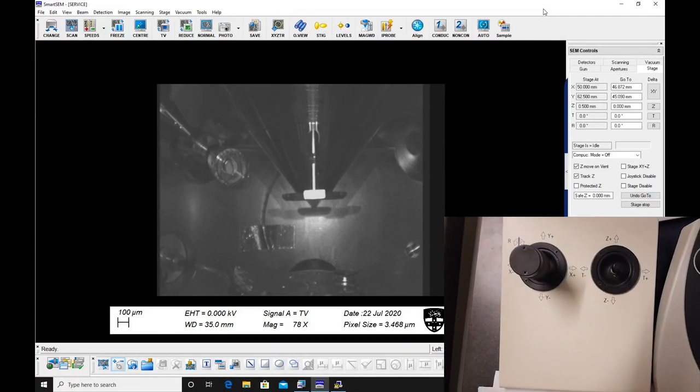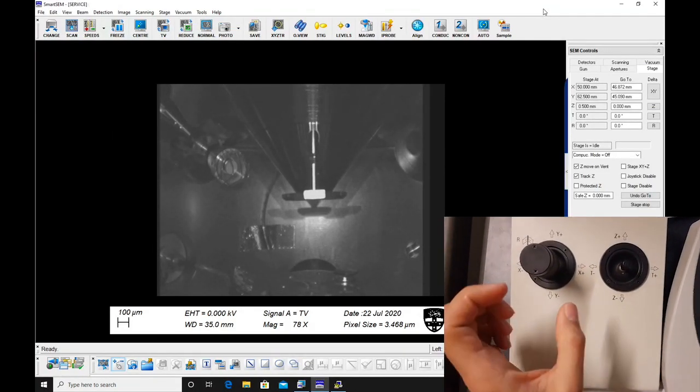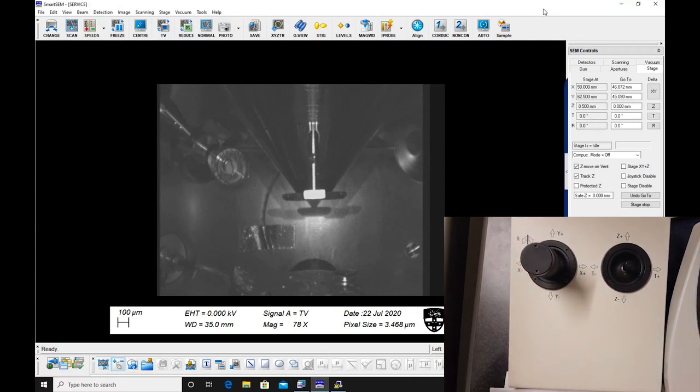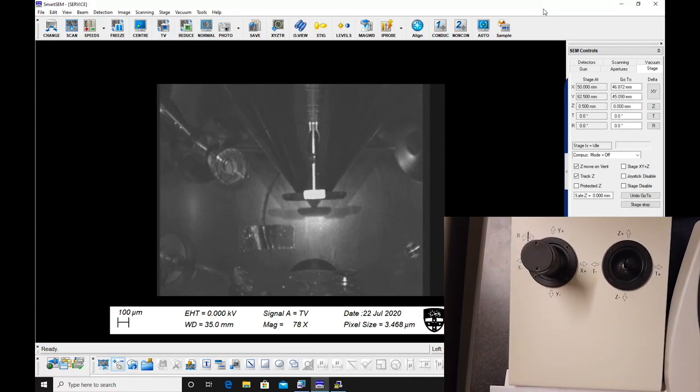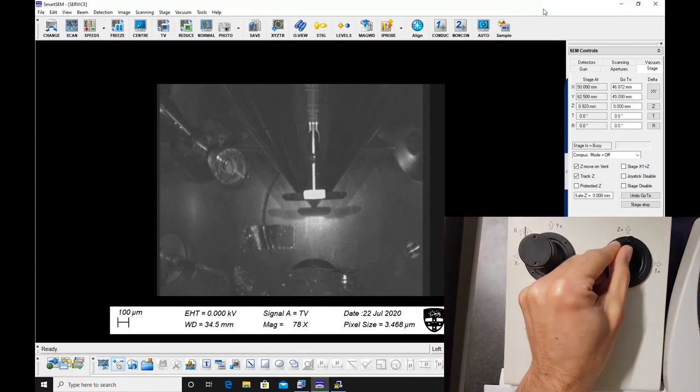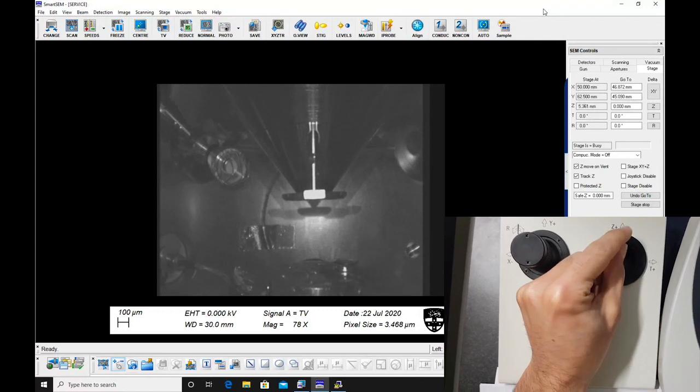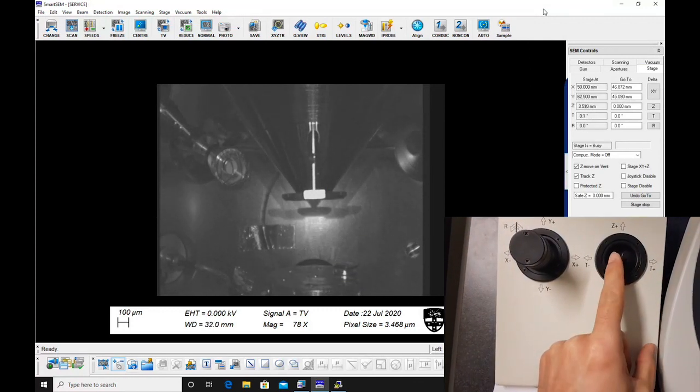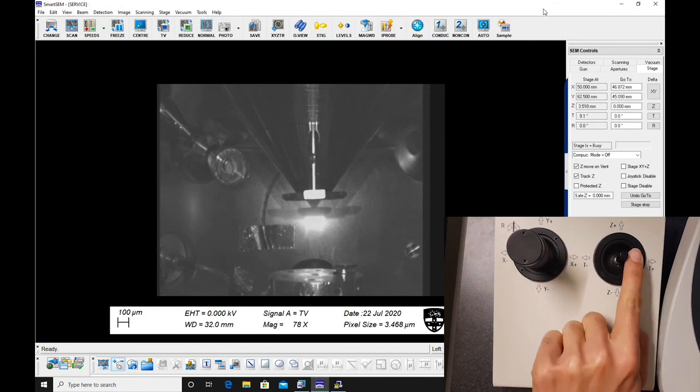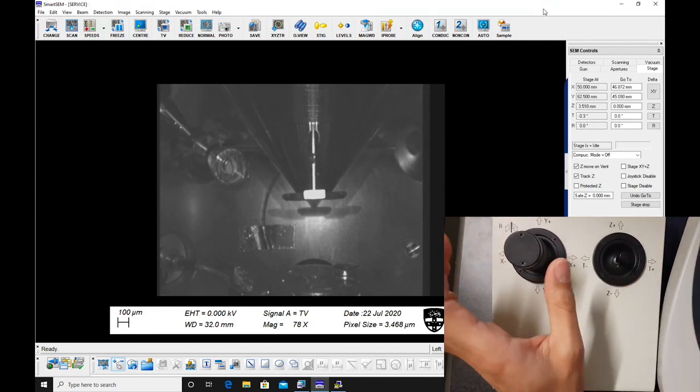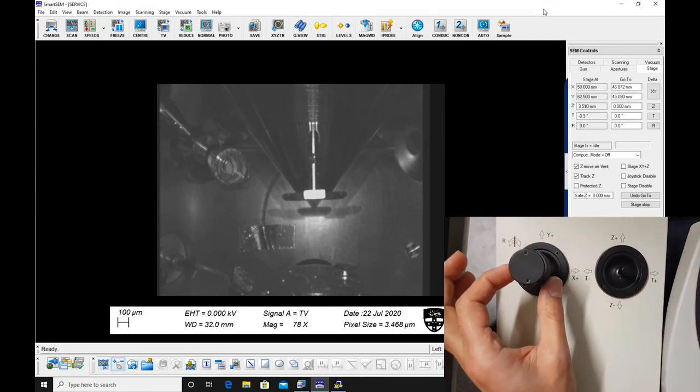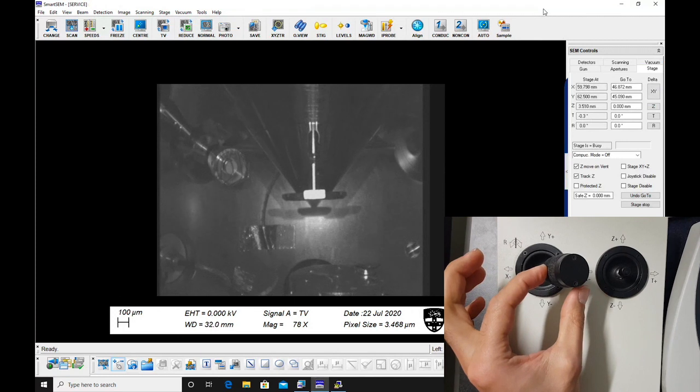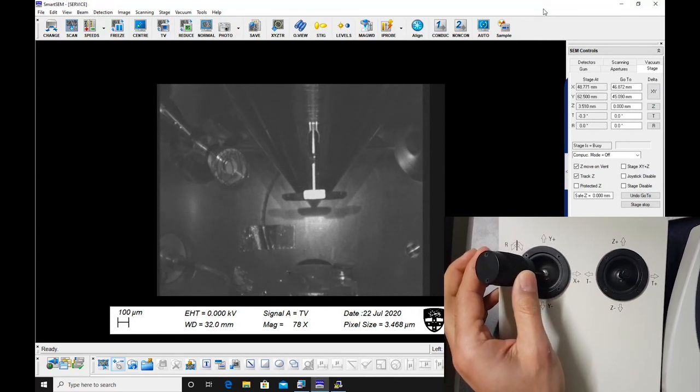There are two joysticks which control stage movement. The thin one moves the stage up and down and tilts the specimen. The larger joystick controls X and Y motion and rotates the stage.